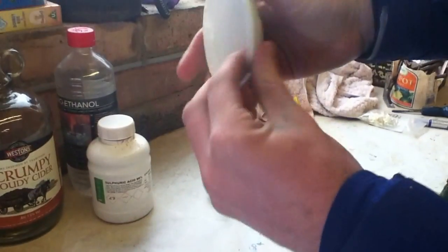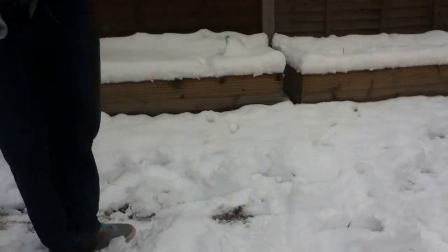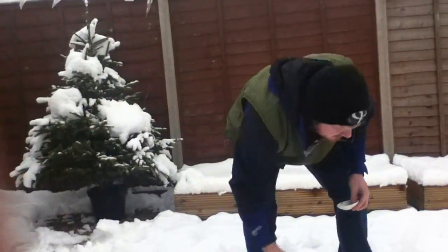Give it a quick mix. This is our dish, there's nothing in it at the minute, just a reacting dish. Right, over we go. I'll take the sulfuric acid or something. I'm going to pop the dish — I'm going to put a bit of gravel around it so you can actually see the dish.